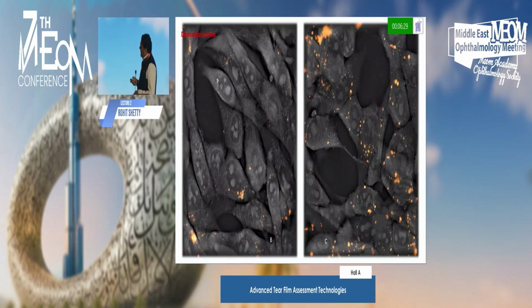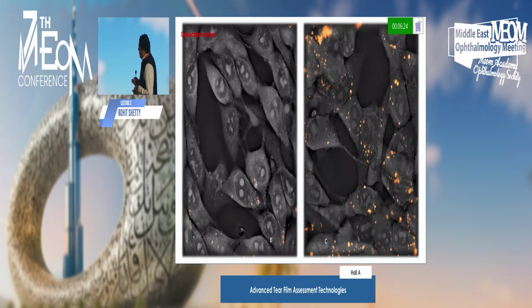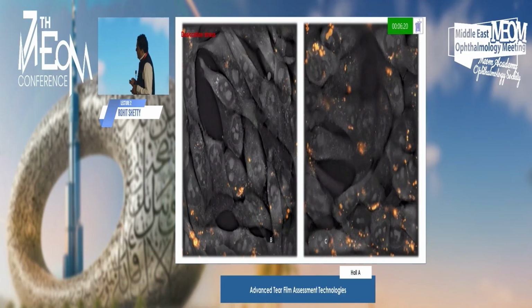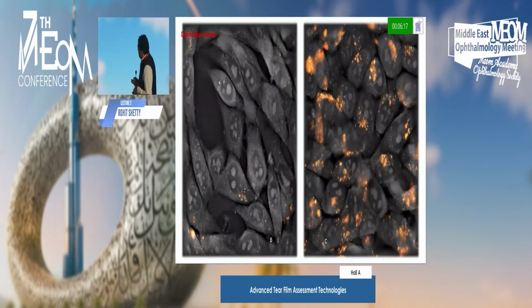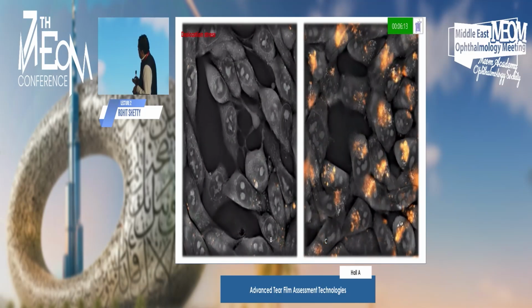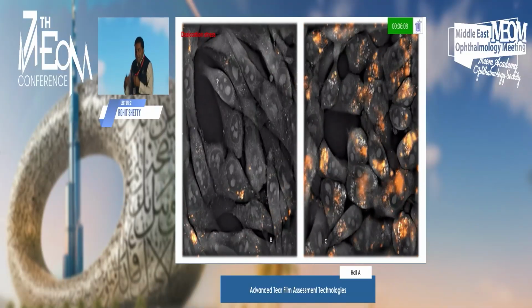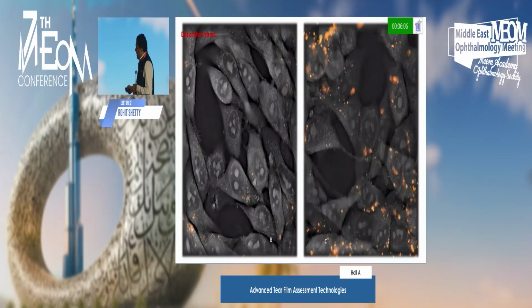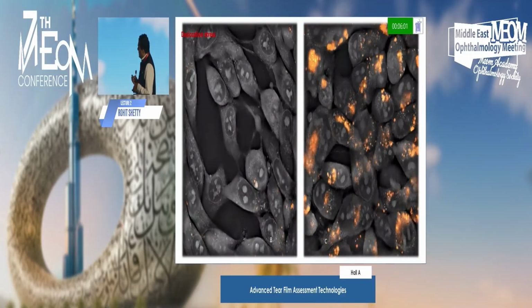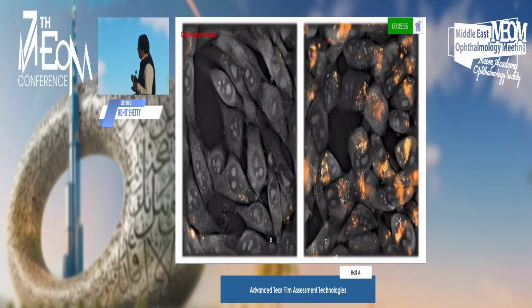This is work we did. This is holotomography of epithelial cells. These are all your Golgi bodies, all your cells. And look at this. Then you create a desiccation stress. You create a stress, and the cells don't function. I used trehalose-based medications. These are lysosomal trackers. These are like tracking enzymes which show the metabolic health of your eye. A lot of our work on the ocular surface uses these cells. And you can see how dry eye kills these cells, and you can see them dying.